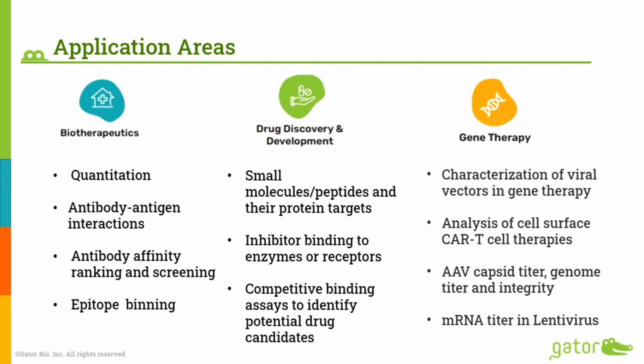Along with that, for this particular case, he wanted us to also do receptor binding information. We can set up those kinds of assays here to get more information using a very simple assay setup. So for this collaboration, we are just in the first phase.